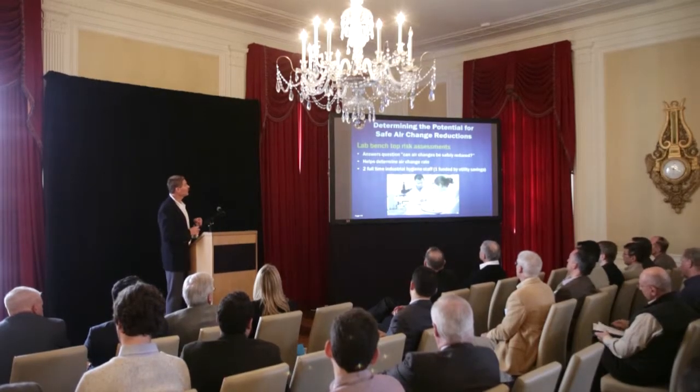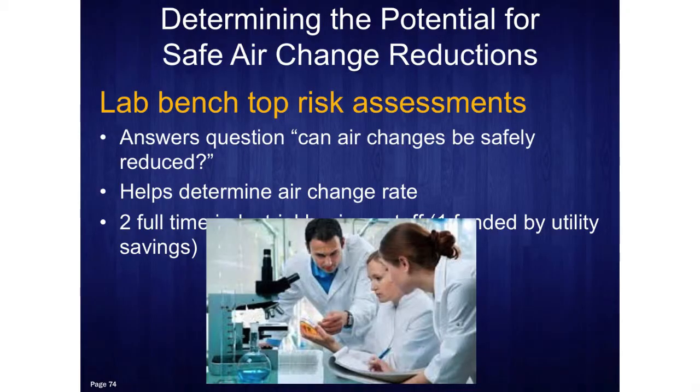So we do lab benchtop risk assessments to determine the potential for safe air changes. It helps us answer that question: can air changes be safely reduced? And we have 2 full-time industrial hygiene staff, one of them funded by utility savings, doing this.